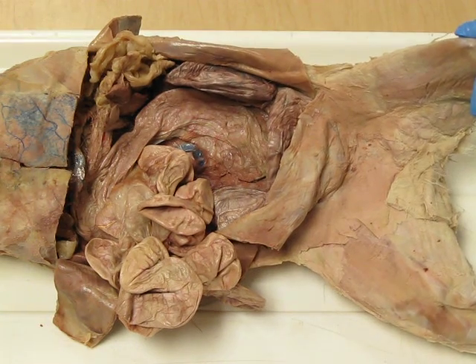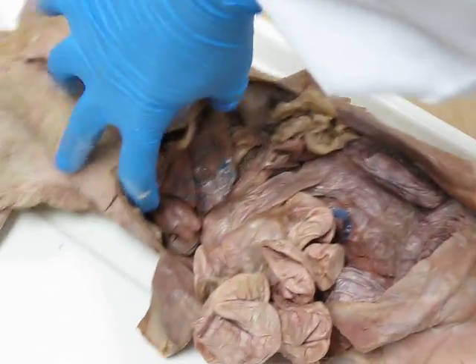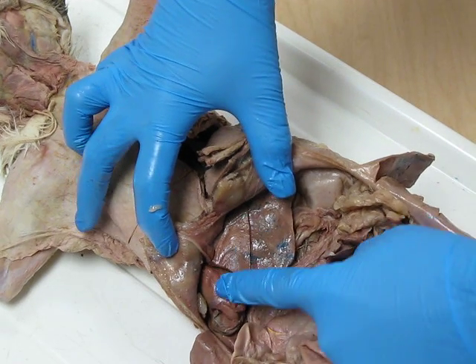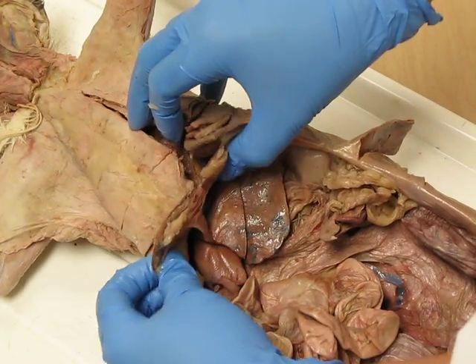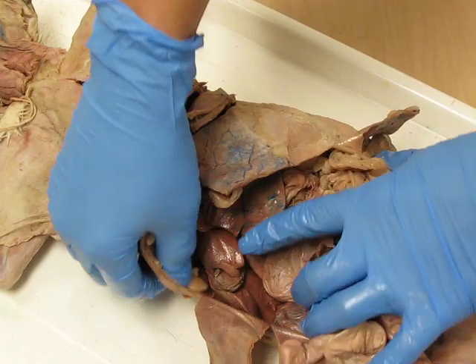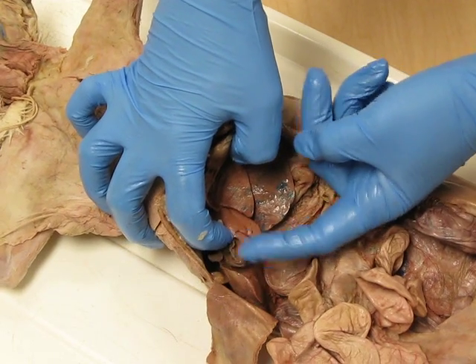Okay, then we have the liver. So we've got the right lobe and the left lobe of the liver. Just position this guy so we can see the liver. Okay. Right lobe, left lobe. Separated by the falciform ligament, which attaches the liver to the diaphragm. Underneath the right lobe is also the gallbladder. It's going to be this pouch right here underneath the right lobe. And a lot of the cats will be very green because it had concentrated bile in it.